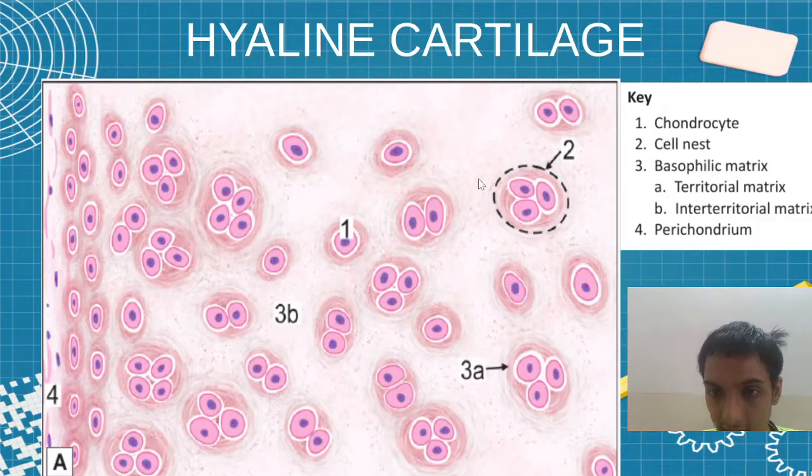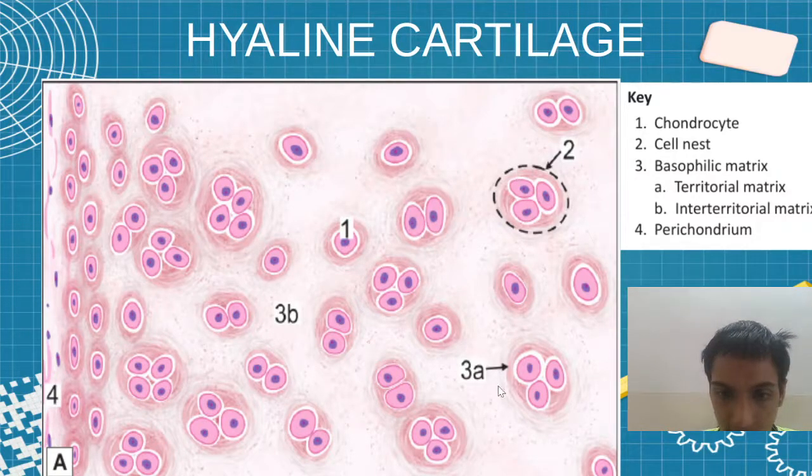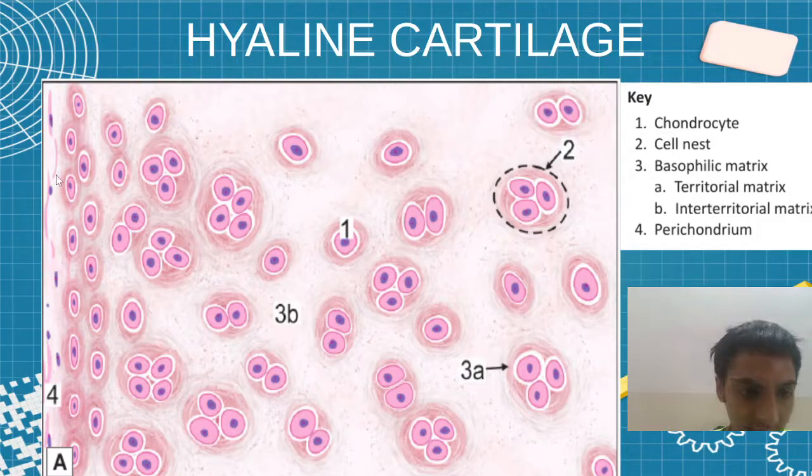This dotted region is the cell nest. This is the basophilic matrix. These are the territorial and inter-territorial matrix. And here you can see the perichondrium layer.